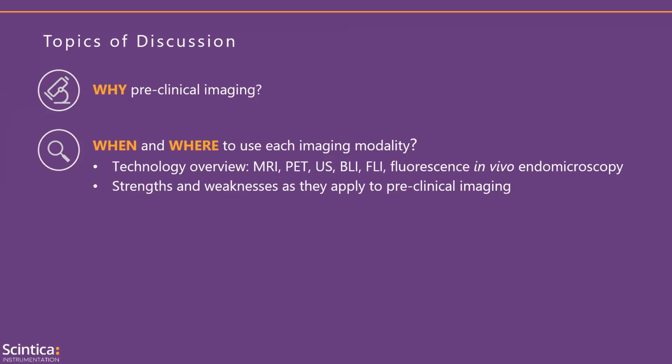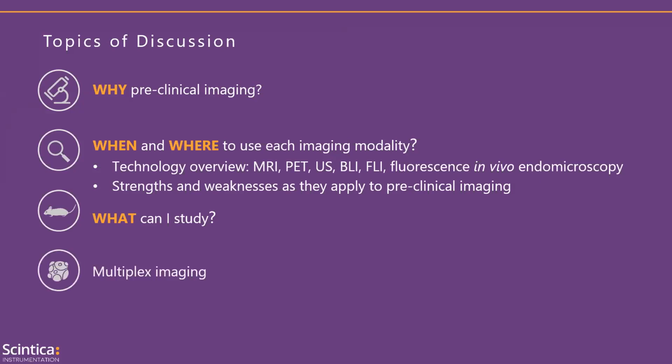We're going to give a very brief technical overview of each modality. We'll discuss some of the strengths and weaknesses of each system, as well as go over some of the common applications, so you can start to understand what different things you can study with each of these modalities. And then near the end, we're also going to cover something called multiplex imaging, so what that means, and then when and where you may want to consider this in your research studies.